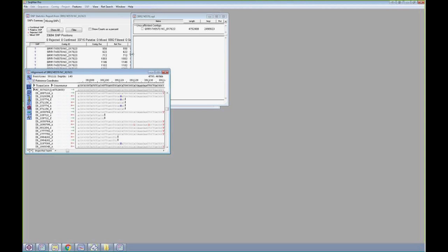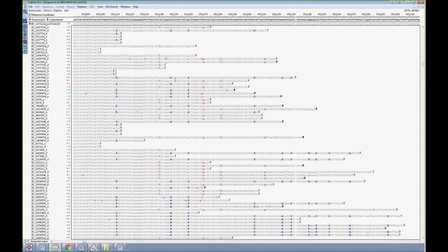But just to sum up, you can see pretty easy assembly setup. And then once your assemblies are completed, you download your results to your desktop computer, and you can do all of your analysis right here in Lasergene Genomics Suite. And if you're interested in any particular analysis workflows, I definitely recommend you check out our other webinars. We have many webinars on different workflows, from RNA-seq to exomes to whole genome. We didn't have much time to cover the analysis today, but we have lots of resources available for that.